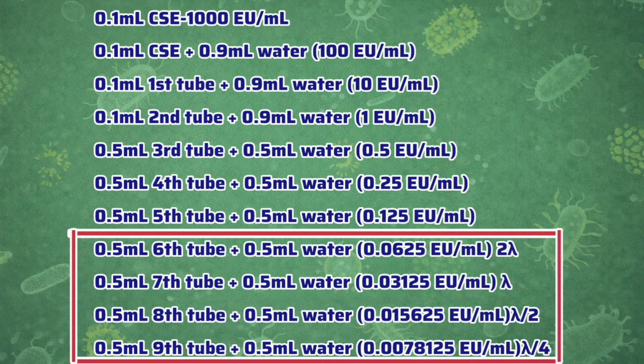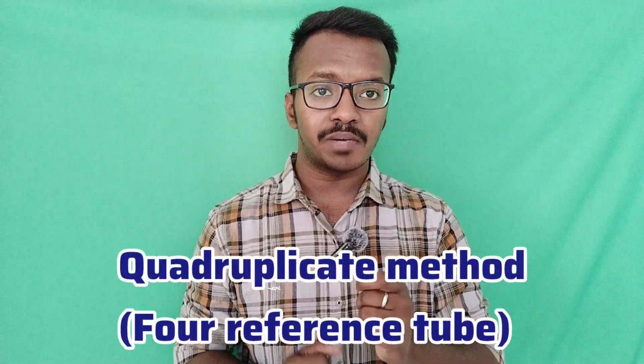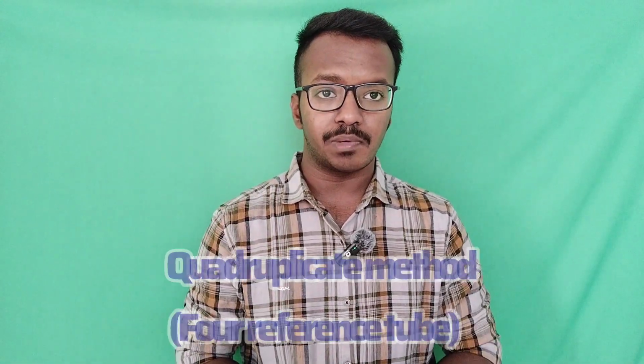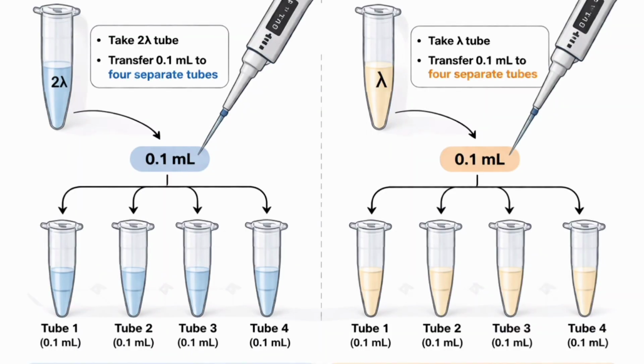The concentrations of 2 lambda, lambda, lambda by 2 and lambda by 4 are to be tested with lysate by the quadruplicate method. Quadruplicate means we should use 4 tubes for verification purposes. So take the standard tube of 2 lambda and transfer 0.1 ml to 4 tubes, and take the lambda tube and transfer 0.1 ml to 4 tubes. The same is followed for the remaining 2 tubes also. Now to all the tubes we need to add 0.1 ml of lysate. So in total we have 16 tubes.